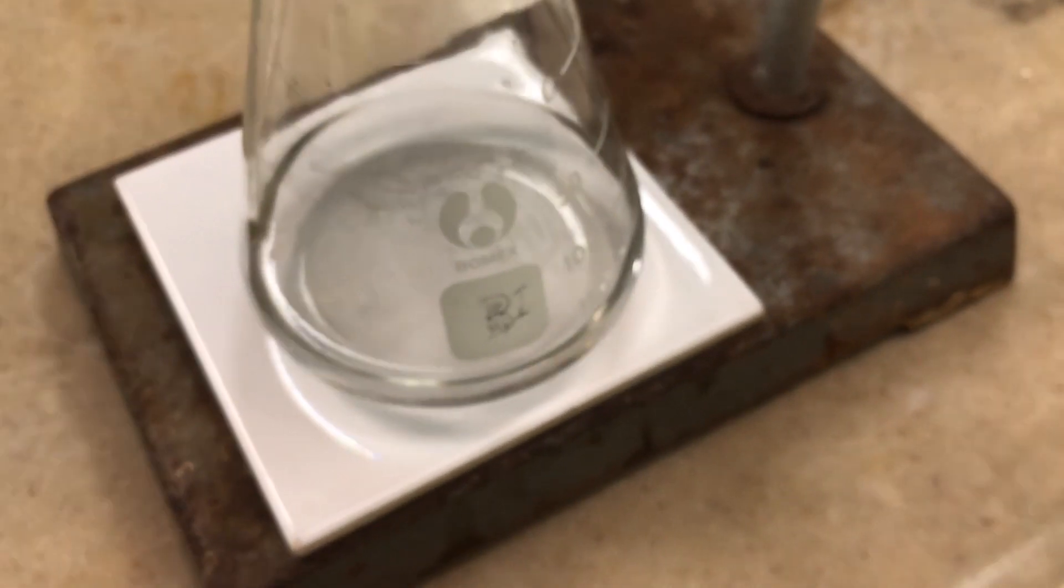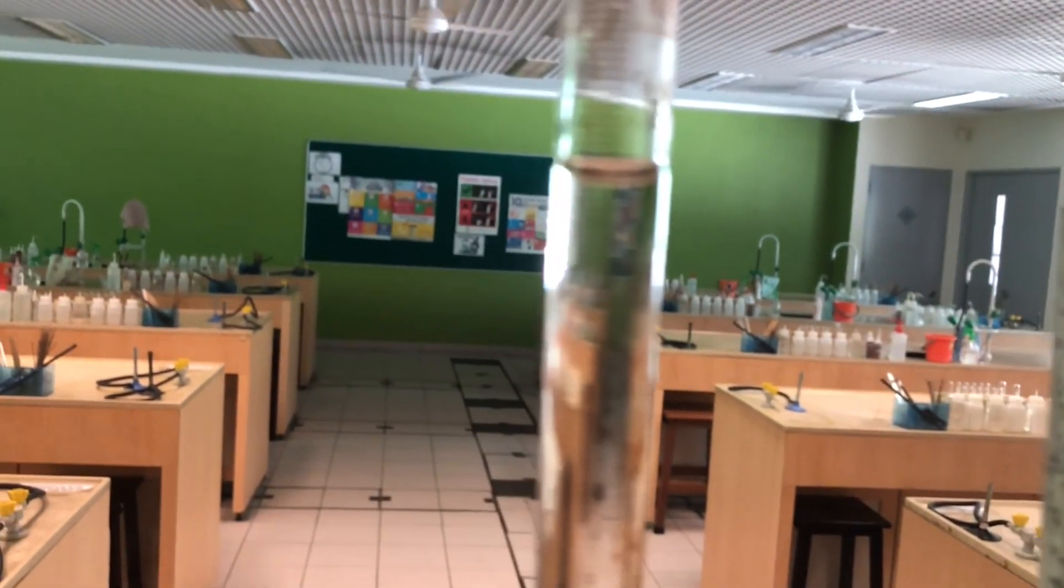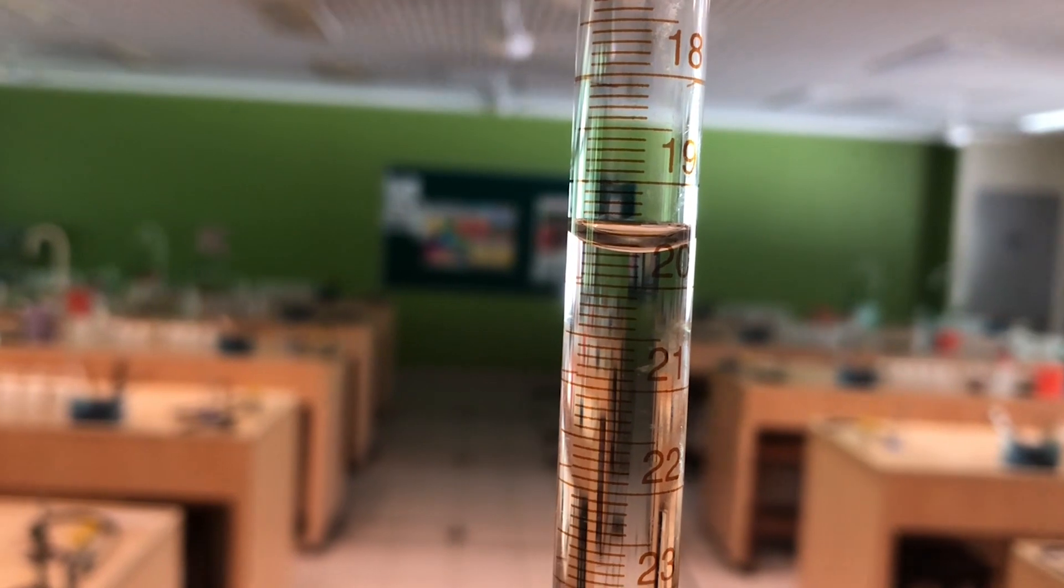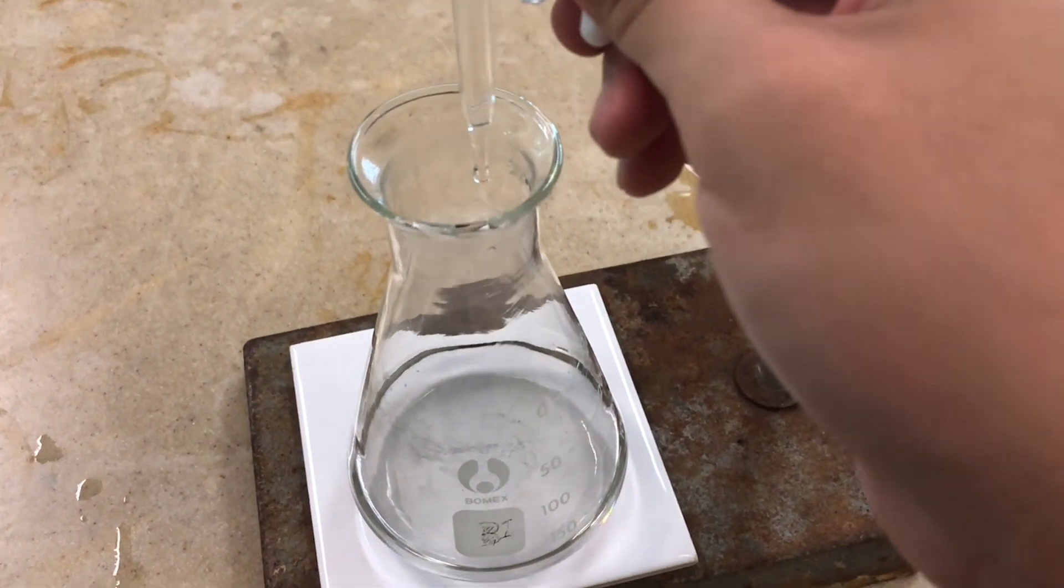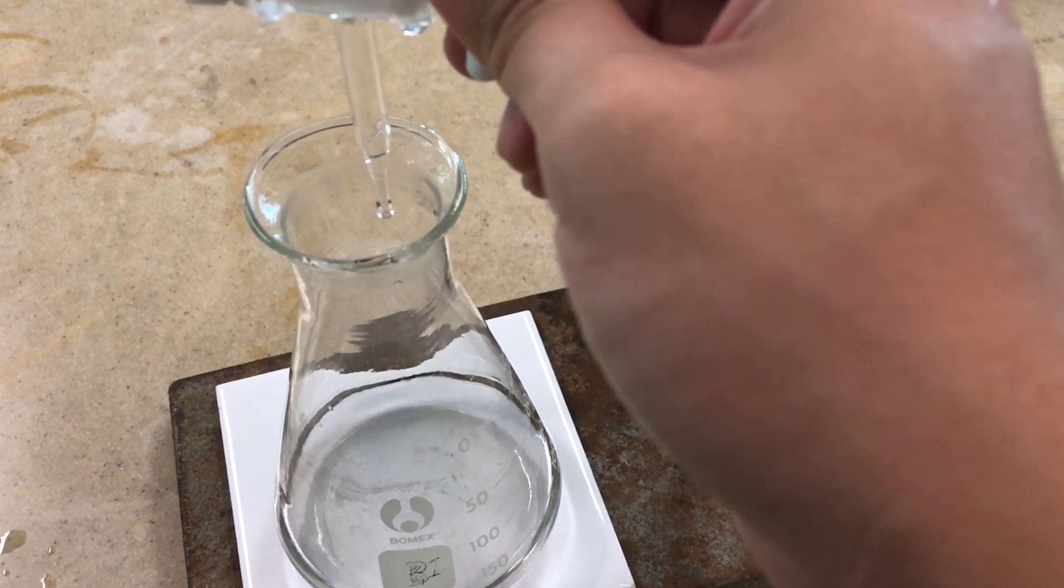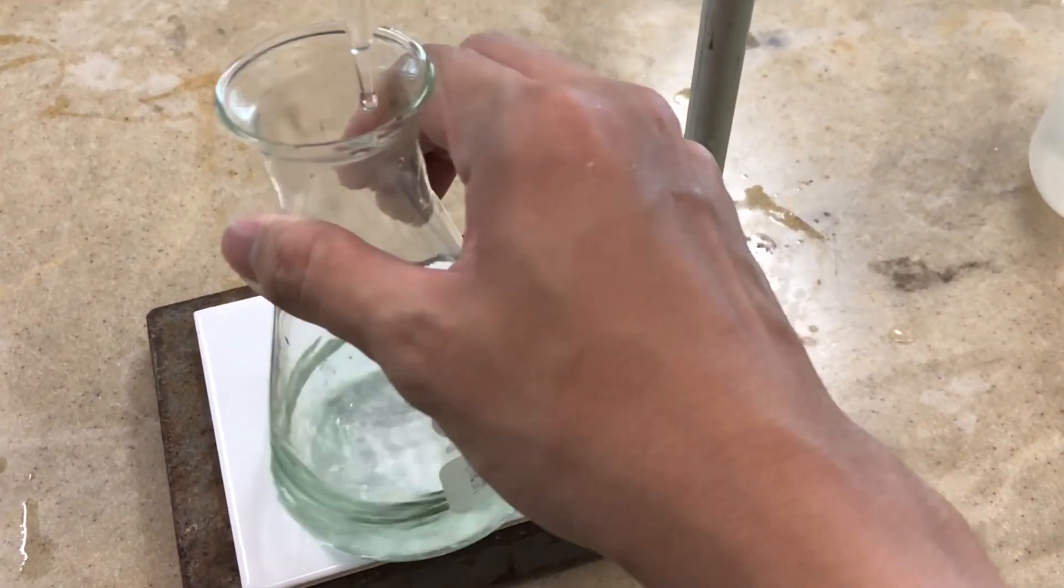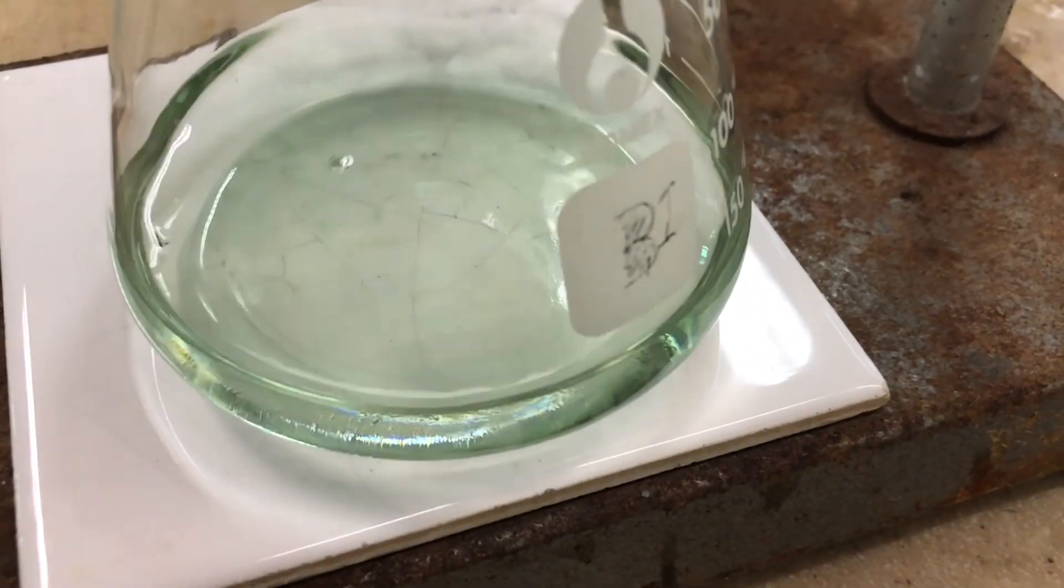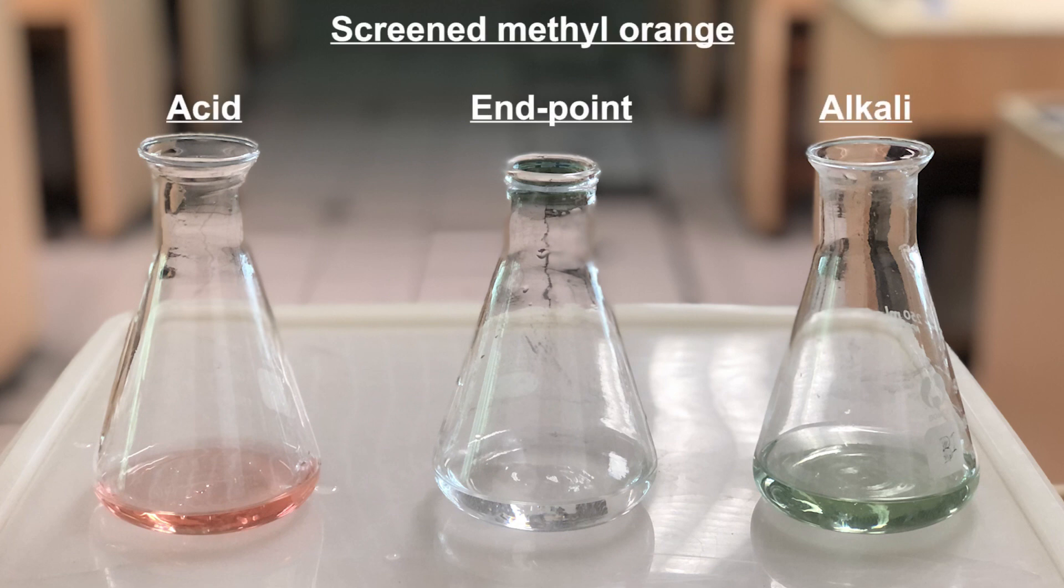But sometimes in the exam, we might doubt ourselves. This is when you need to do a bit of checking. You can first take a look at what is the burette reading, record down this final burette reading first, then proceed on to add another drop. Now when adding this other drop, if you notice that there's another color change, that would mean that you have exceeded the end point and the end point was supposed to be when it is already grey in color. Now this one drop actually causes the solution to turn into green. Remember that an indicator is not supposed to give you two sets of color change when it achieves the end point. So therefore just now when it was grey was when the color change should have already occurred. Adding in one more extra drop would have caused the solution to become too alkaline, hence giving you a green solution. That means you have exceeded your end point.